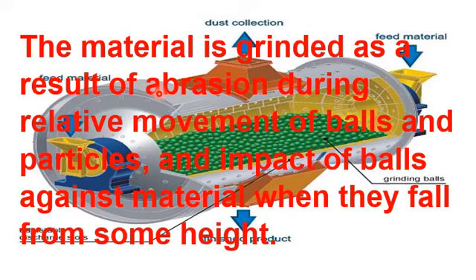So the grinding starts due to external force, starts abrasion with the bulk material, and due to abrasion and impacts of the balls with the bulk material, they result in a conversion of the bulk material into a fine nano powder.